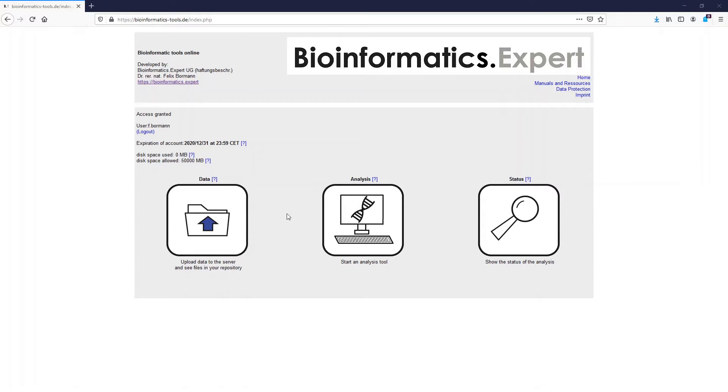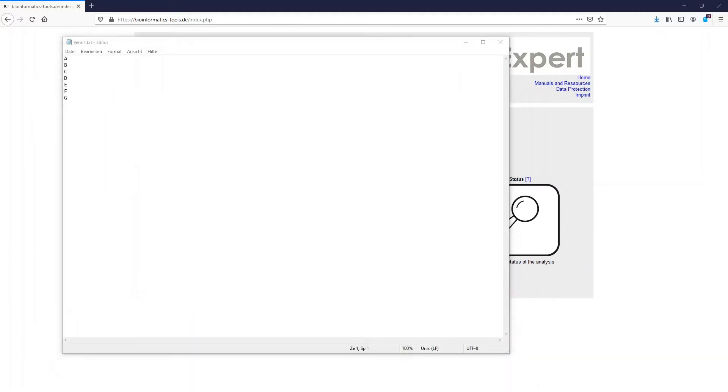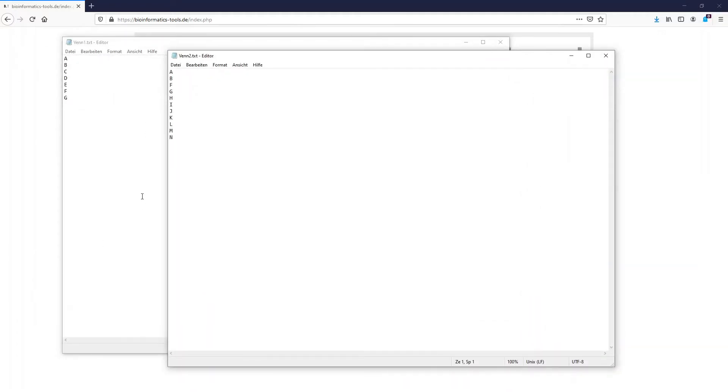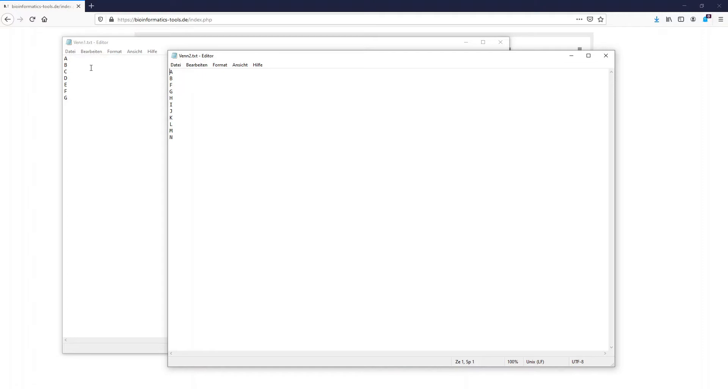To run a Venn Diagram you need text files of the different lists which contain the features which you want to compare. This is an example of those list files. You see letters, and with the Venn Diagram you can now find out how many overlapping elements we have. For example, A or B are overlapping whereas C is only present here. That means it should not occur in the overlapping area.